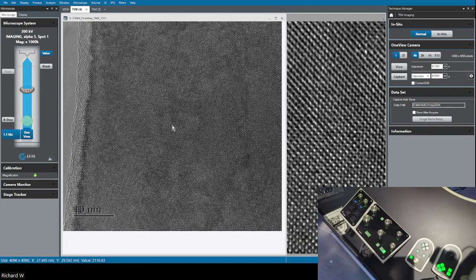Sure, thank you. Are there any other questions for NTU? Yeah, thanks for the nice talk. Can I know about the sample you just mentioned, prepared by FIB? How about the FIB process? Do you use low kV, 2 kV or even 1 kV, to low polish?